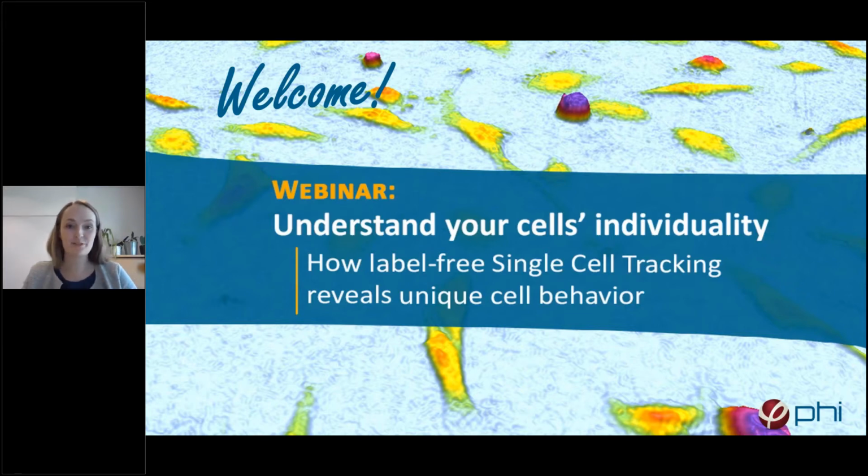We're happy that you joined us for this talk on the topic of how label-free single-cell tracking reveals unique cell behavior. Studying heterogeneity in cell culture is a central topic, not only important to tumor studies. Some of you listeners might try to find out how to spot outliers or subpopulations in your cell cultures, or maybe you're trying to discover unique cell behavior across your kinetic cell growth, morphology, or movement data.